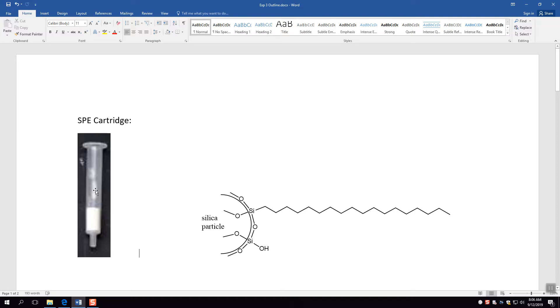What's not typical about it is it has this silica gel bed at the bottom of it. So we can load liquids into here and then use a plunger, a standard plunger like you'd use on a plastic syringe, and we can push them through. There are more sophisticated ways of doing solid phase extraction, including using things like robots, vacuum boxes, things like this. This may be the least sophisticated way of pushing liquid through, but the principles that you're going to learn here are identical.